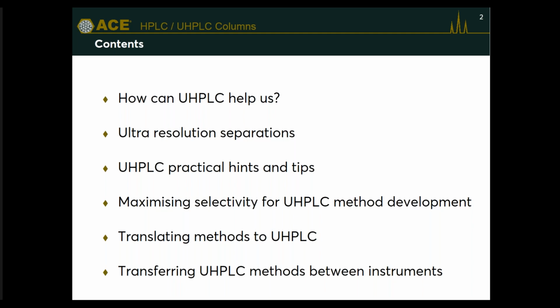I'm also going to then move on to how we can translate methods from HPLC to UHPLC. What are the things we need to consider? What are the tools that we can use and that are available to help us get as accurate translations as possible, particularly to use the speed advantage of UHPLC.